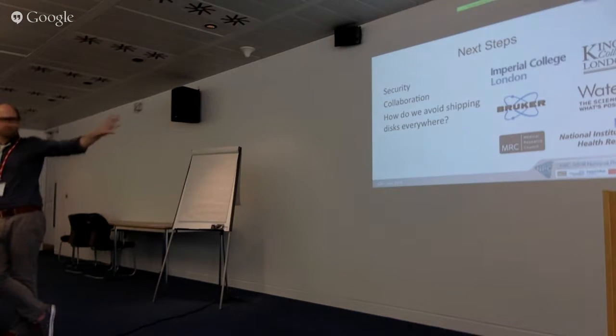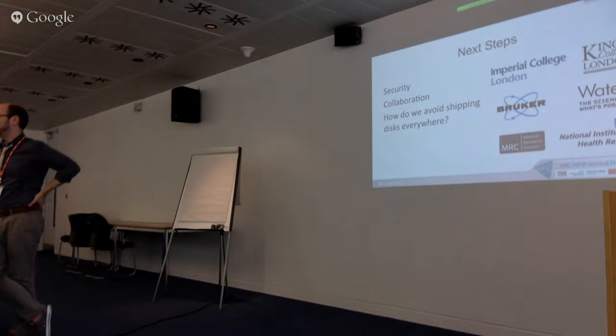Right now, the field of peak picking is still in some flux. I think it's crazy to throw away data. There's no telling we won't get there in 2 years' time and be able to find something much more interesting and just get more reliable information in data sets.